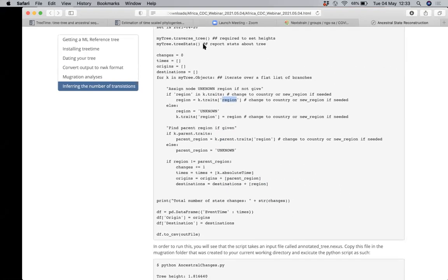Okay, any other questions? Eduan, question in the chat, what QC cutoff do you use for sequences to include in the analysis? Okay, so that's why we do the QC analysis before we do the alignment. For our African paper, we only include sequences that have more than 90% genome coverage.